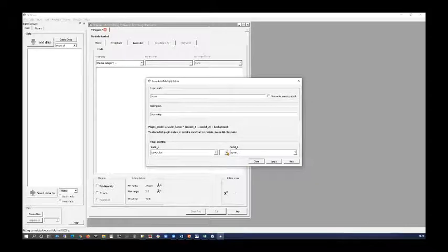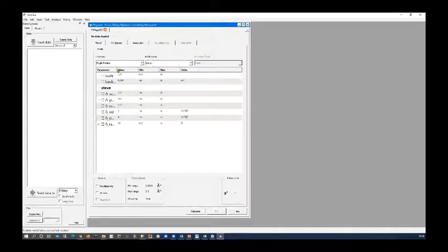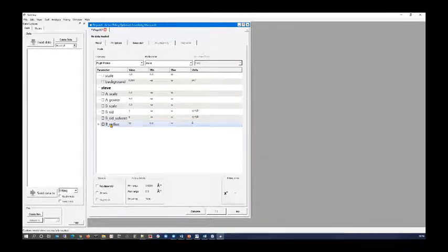There we go. And we can choose whether to add those models or multiply them together. Normally you would add them unless one of these models was actually a structure factor. And then I can click apply. And then if I look in the plugin models category, I'm hopefully going to find, there we go, a model called Steve. Okay. And the power law parameters are prefixed with A, and the sphere parameters are prefixed with B. So that's a quick way of combining two models.